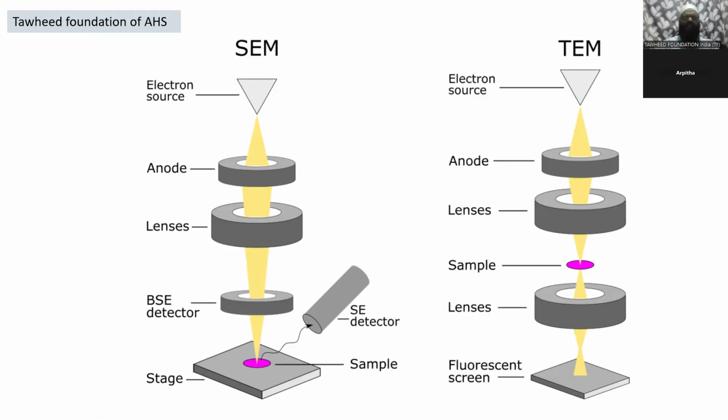To move these electrons down the column, an accelerating voltage, mostly between 100 to 1000 kilovolts, is applied between the tungsten filament and anode. The specimen to be examined is made extremely thin, at least 200 times thinner than those used in optical microscope.